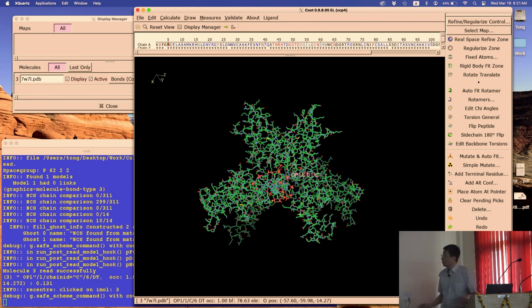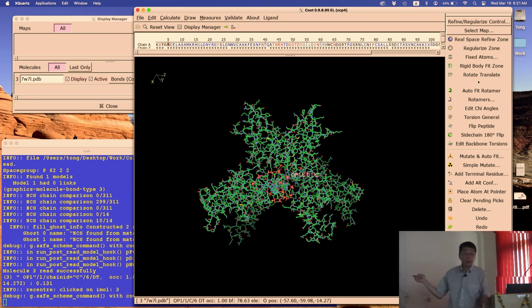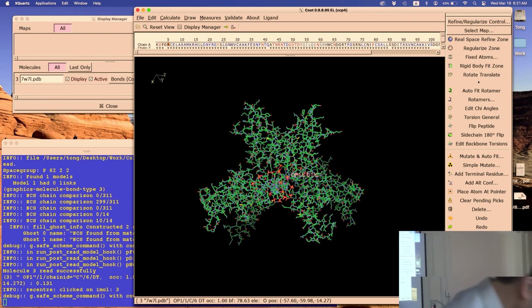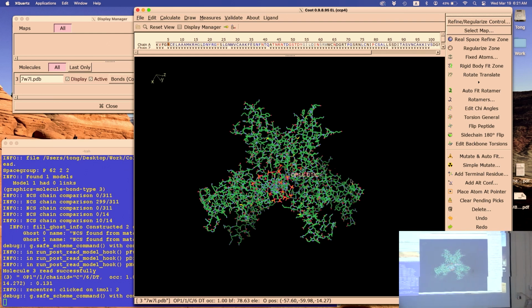Okay? So it should look something like this, right? This is what you have. Click on this, and then 7W7L. You should have it, right? Open that file.